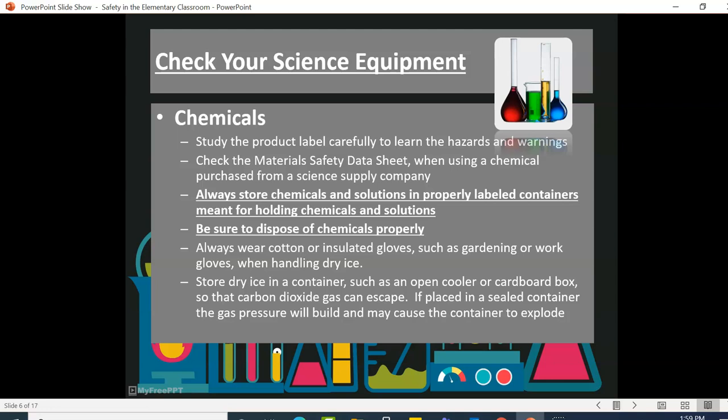If a student is injured as a result of coming into contact with the chemical, the MSDS sheet will explain what to do. Be sure to send the injured student to the nurse's office along with that sheet. Every MSDS should be on file in the school district office as well as in the school or science department office. Copies should be available for every classroom.